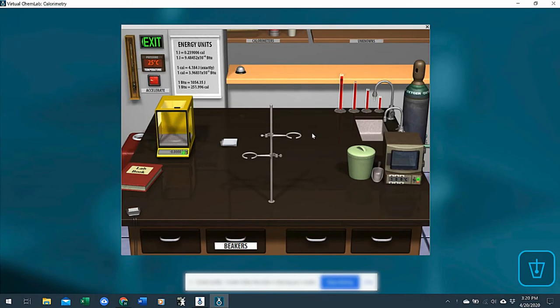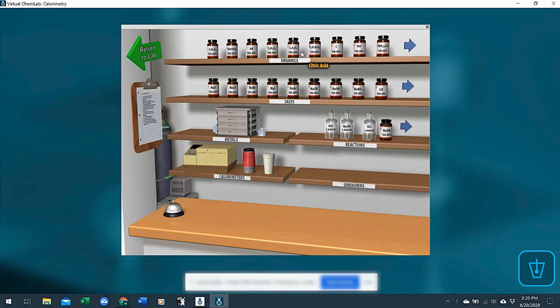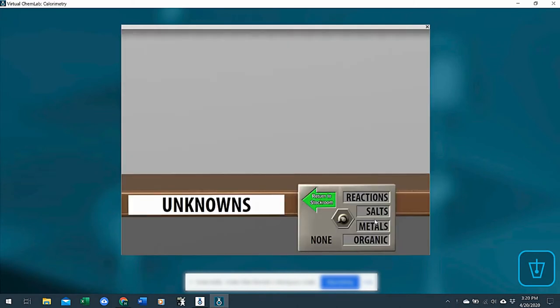Hi instructors, I'd like to walk you through how to use unknowns in the calorimetry lab. Once you've taught your students how to find specific heat or heat of solution, heat of combustion, heat of reaction, they can test what they've learned with an unknown using this unknown shelf here.